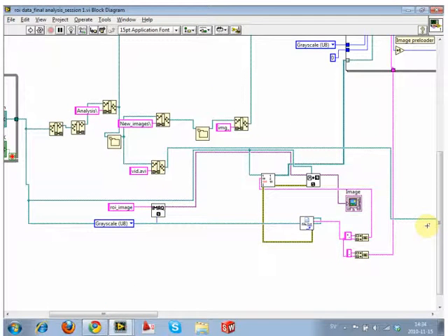The confocal software is a good example of badly managed data, because it puts all the images and the LEI file and the text file and everything in the same folder. So if you actually wanted to analyze that data set, you have to tell it to filter. But in this case, what is the point of doing this and not putting something like channel 00? For example, when you want to filter on confocal, you can make this pattern. I don't get the difference.